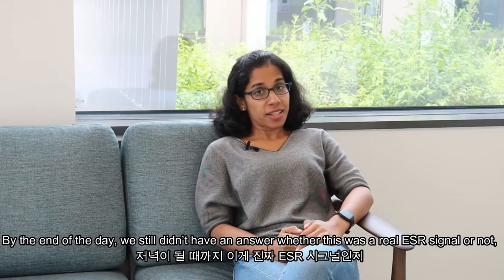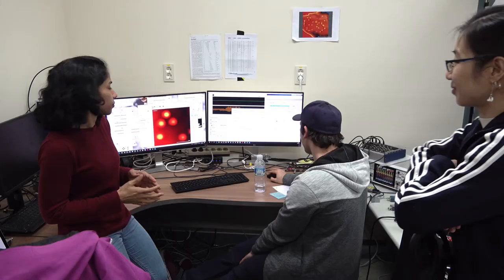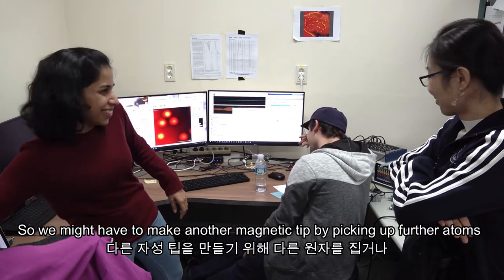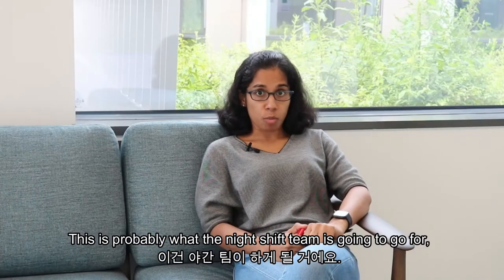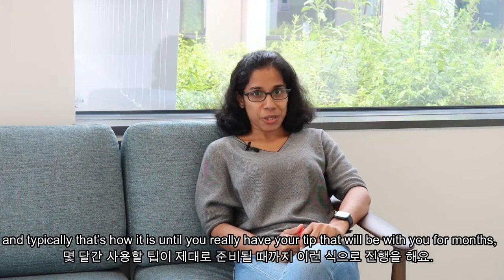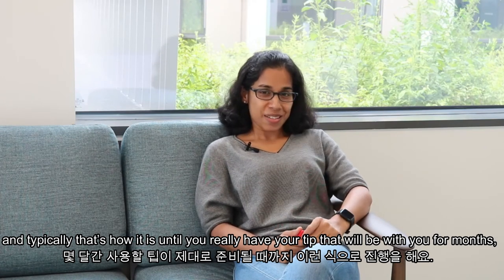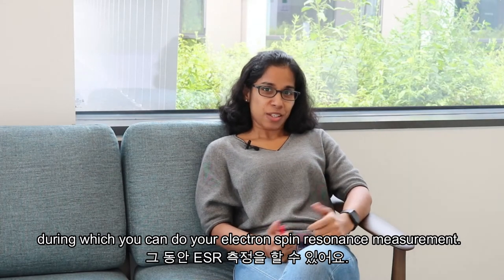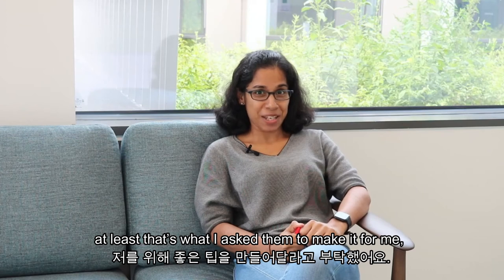By the end of the day we still didn't have a definitive answer on whether it was a real ESR signal or whether the tip was good enough. We might have to make another magnetic tip by picking up more atoms or dropping and re-picking them. That's probably what the night shift team would go for. Hopefully, by the time I came back the next morning, they would have a good tip ready for me to start with ESR measurements.